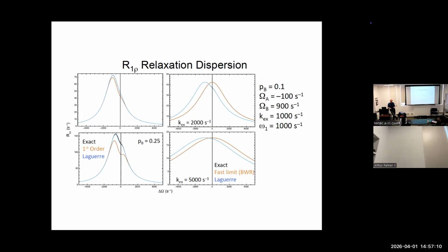Generates a lot of heat. Yeah, well, if you work on ubiquitin, that's not your biggest concern. So Christian has been trying to push these experiments down to the few microsecond time scale. And that takes very large field, which in the end you need a special probe for.